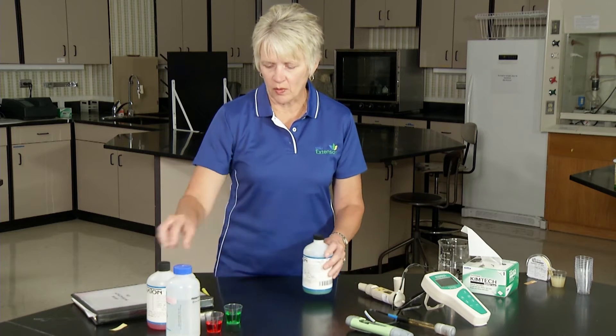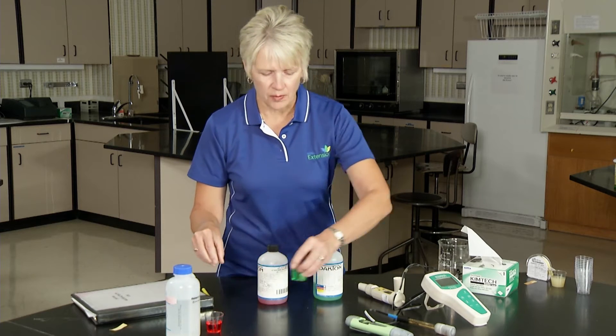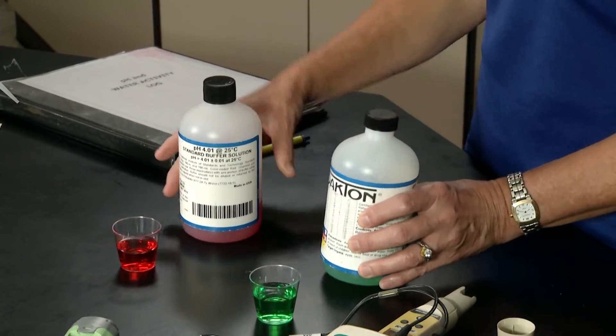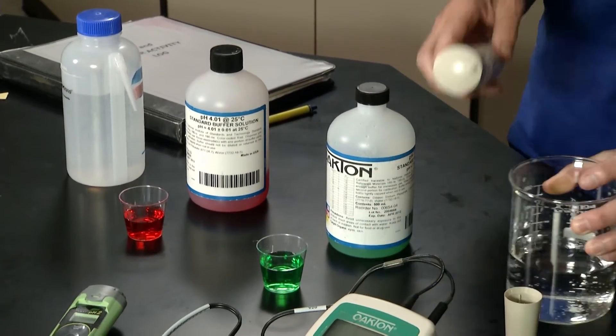To begin with we have to always calibrate our meter. We're doing a two-point calibration and we're using a 4.01 buffer and a 7.0 buffer. The other thing that we need is water, and this meter uses just regular tap water.